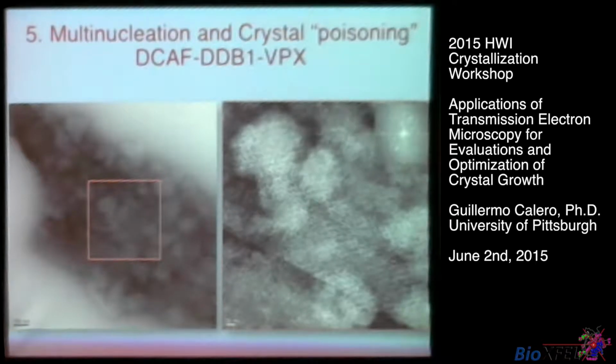So, I mean, we thought this was a very useful observation because from here, the problem was really that probably the protein was aggregating. So we needed to do something to the protein and apply protocols that would clearly slow nucleation, using probably detergents or additive screens or other things. But this was very reassuring for us.